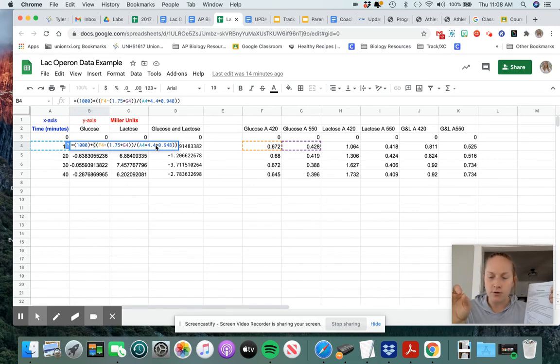So the 4.4 is the total volume, which is found in the next unit here on this equation. So we have time. You don't need to change time. I set it up for you. You don't need to change that. 4.4, that is the case for each of your tubes, so you do not need to change that either.